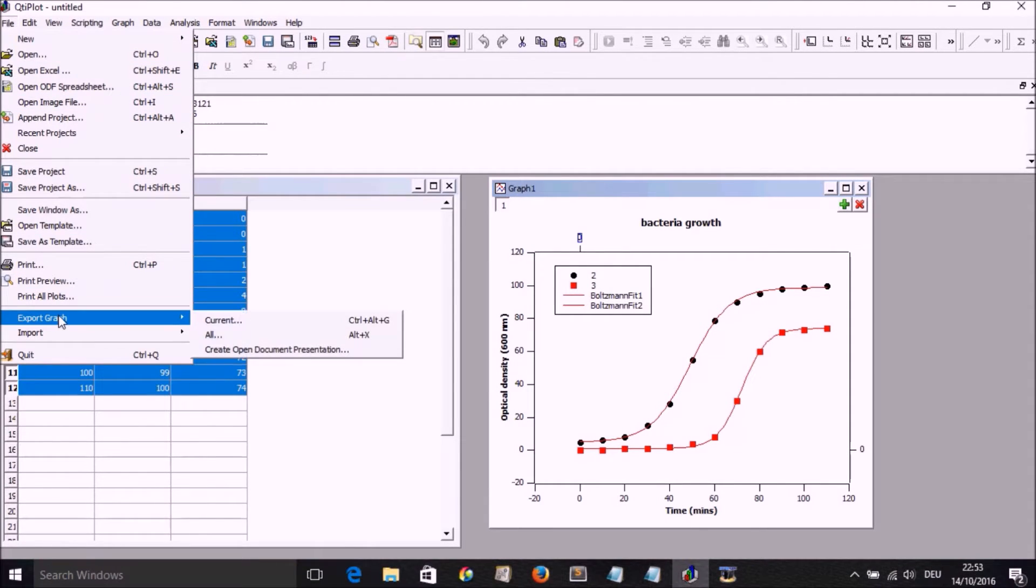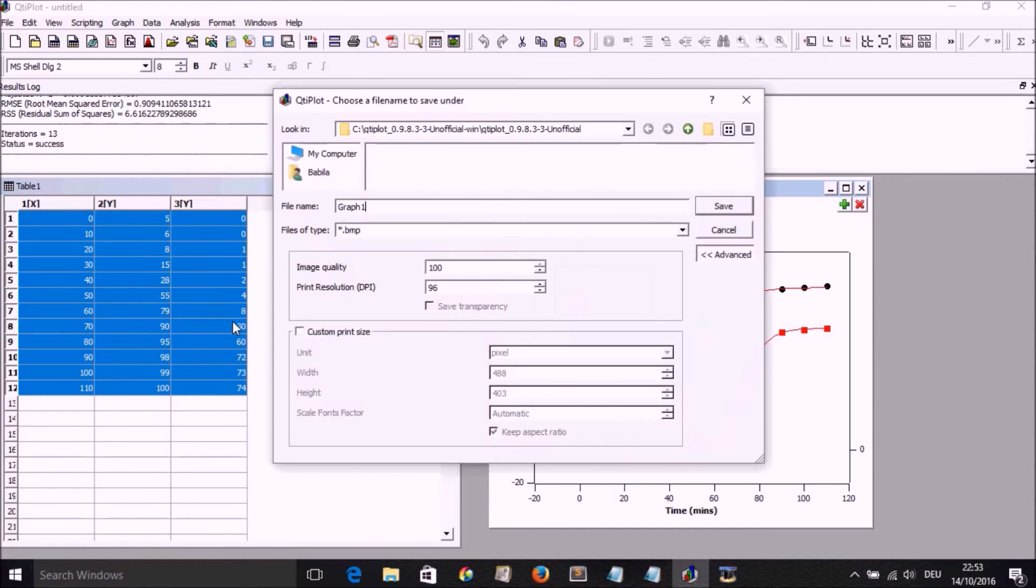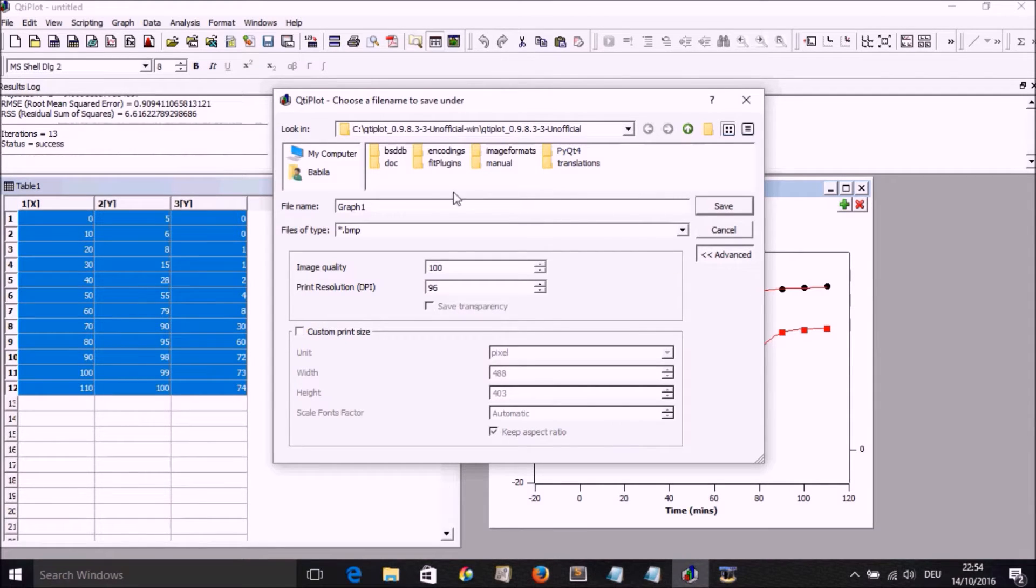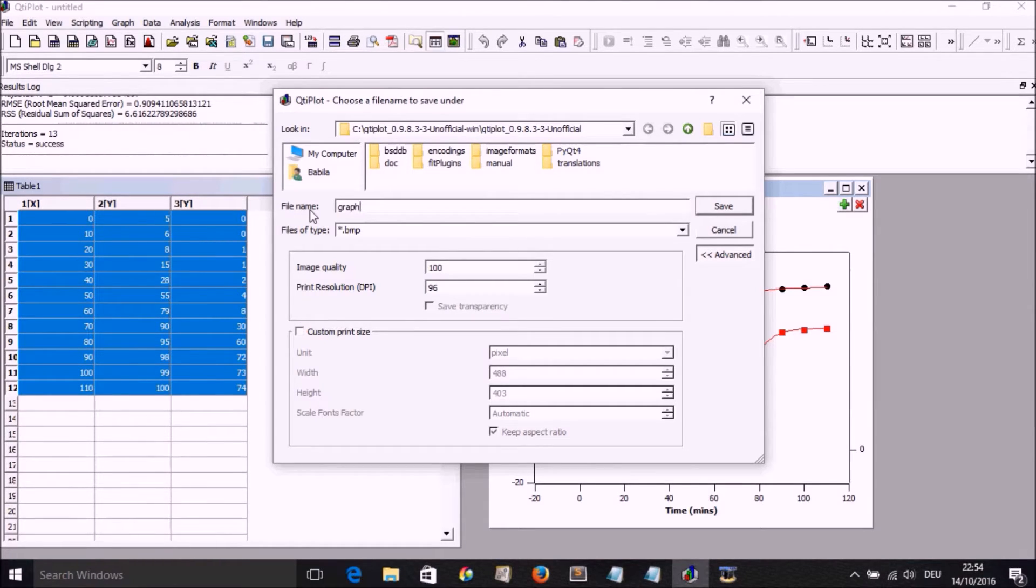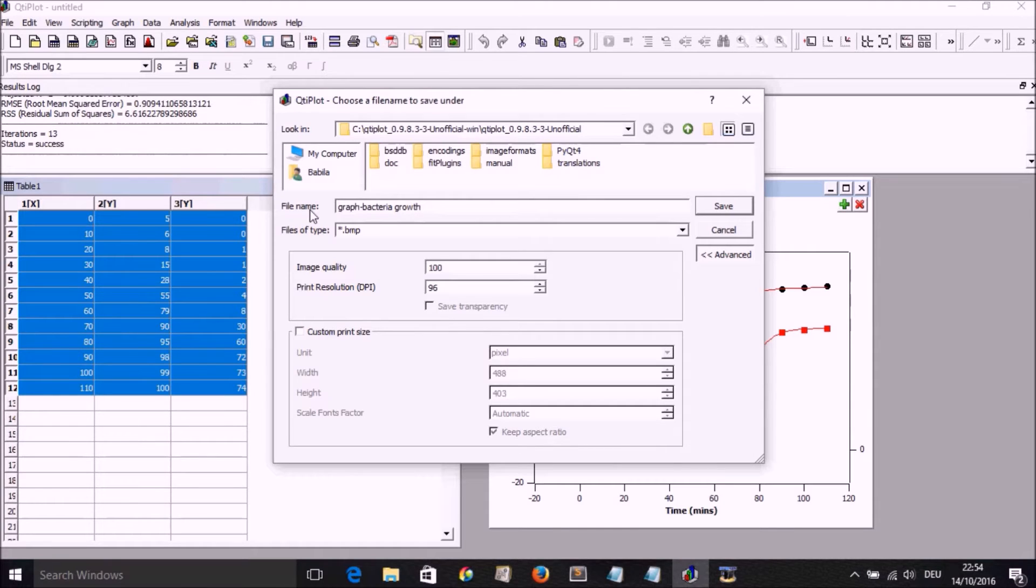If we go to File, Export Graph, Current Graph, we then export it as a PDF. Change the name. So I've just chosen a simple name there, Graph Bacteria Growth.